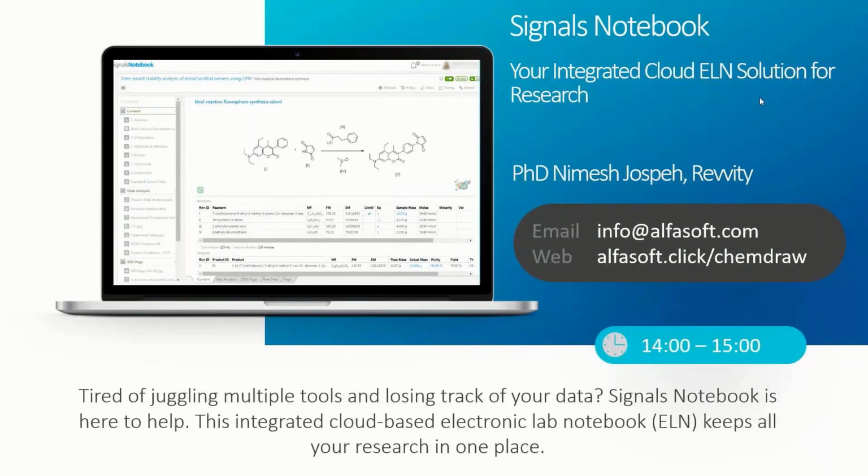Say, for example, if it's a compound synthesis, you can specify that this is the amount that I would like to have, or certain assays to be carried out. These are the assays I would like you to do on these compounds, for example. Now, work orders can also include various files, such as protocols to be followed, or manuscripts which have published similar data in the past, something like that.